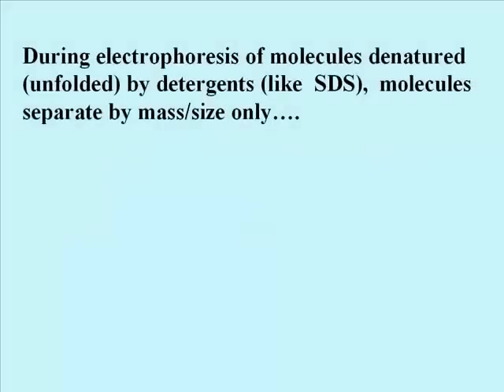A technique for separating proteins on differences in mass alone is SDS, that stands for sodium dodecyl sulfate, which you don't have to remember, or SDS, or denaturing polyacrylamide gel electrophoresis, sometimes referred to by its compound acronym SDS-PAGE. Proteins moving in SDS-PAGE are denatured, so that they differ from one another mainly in length, and that's a pretty close approximation to mass.